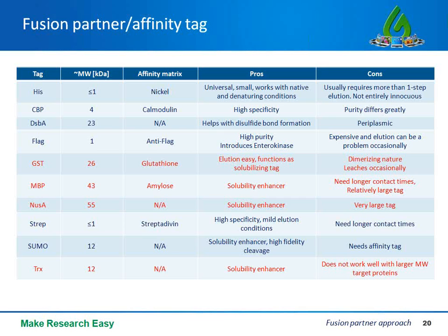So as you'll know, one way to improve the solubility of a target protein is by fusing it downstream of a soluble fusion partner, and this in my opinion is the best way to produce soluble protein. Now of course each tag has its pros and cons, so we need to evaluate the experimental requirements carefully when we select a particular tag. In this table we list some commonly used tags. Just note that the ones in red font are those that I'll discuss a bit more in the next few slides.